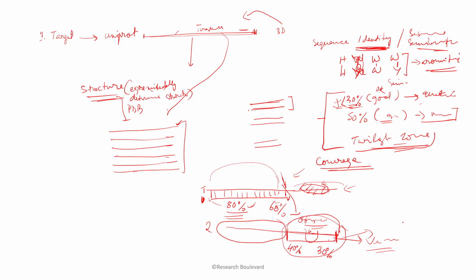So this is why I'm telling you that homology modeling or Modeler, though it's a very old technique, is still very useful. When you give the whole sequence to AlphaFold, it will just build the model, and you cannot manipulate anything. In this case, we can remove or adjust the alignment.